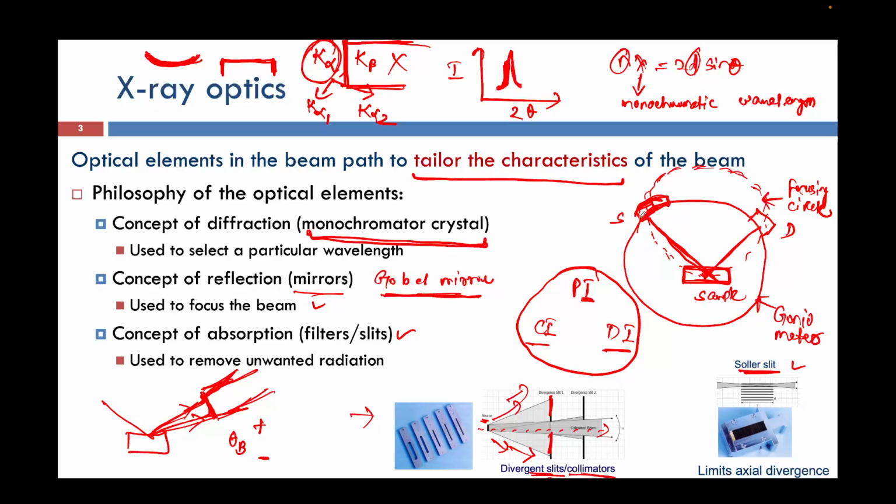Since we can make it a little bit curved, let's say from another angle, if this is now not my source, when I put a Göbel mirror, this is not my source, it will be somewhere here, and from here I release the X-ray beam. Based on the Göbel mirror's d, that means the interplanar spacing, whichever value I get, here at this position I will be getting my first reflection, right, and then at this position I will be getting my second reflection.